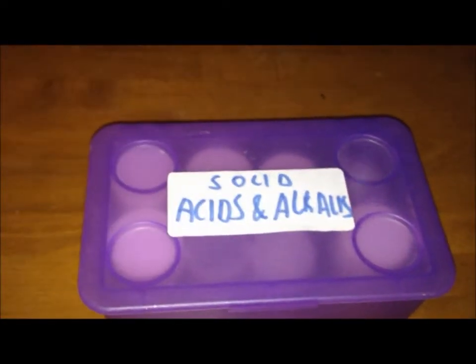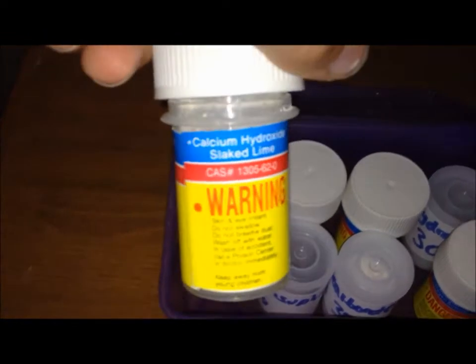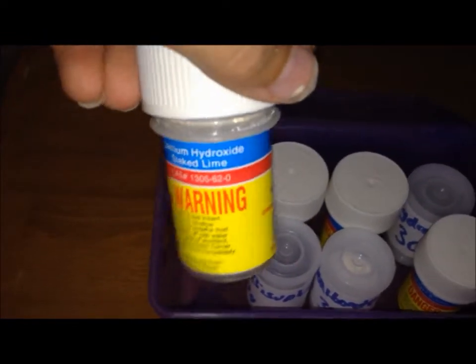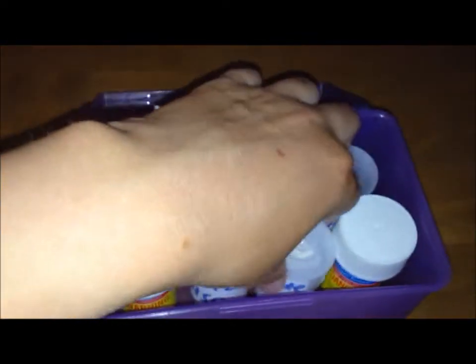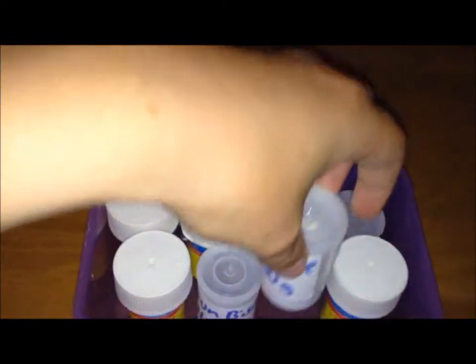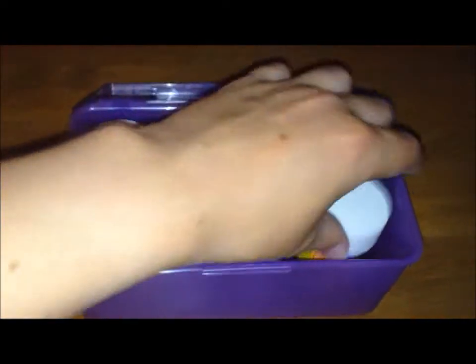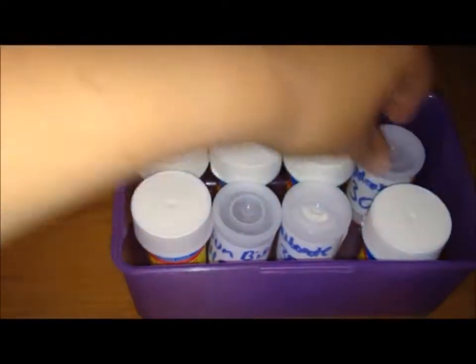Moving on to solid acids and alkalis that I keep in my box. In here we have calcium hydroxide, which I used to make lime water. We've got sodium bisulphate which I made myself — it's not very pure. We've got sodium bicarbonate, which is useful for film canister rockets. We've got sodium bisulphate, a lot more pure, that came with the set.